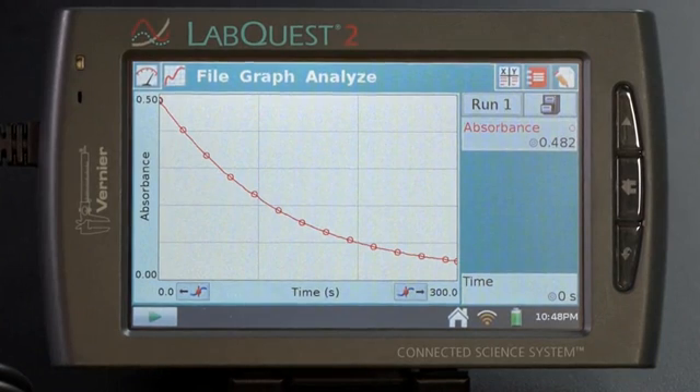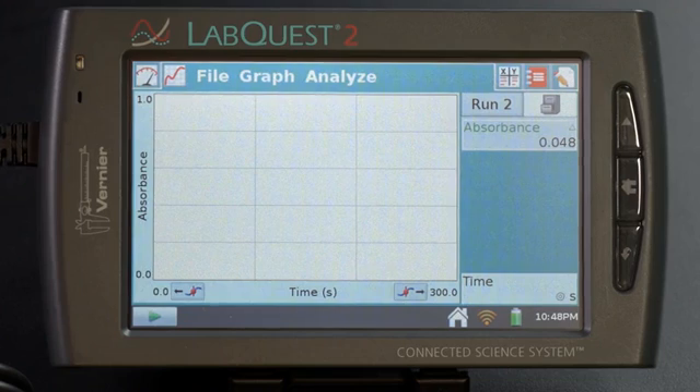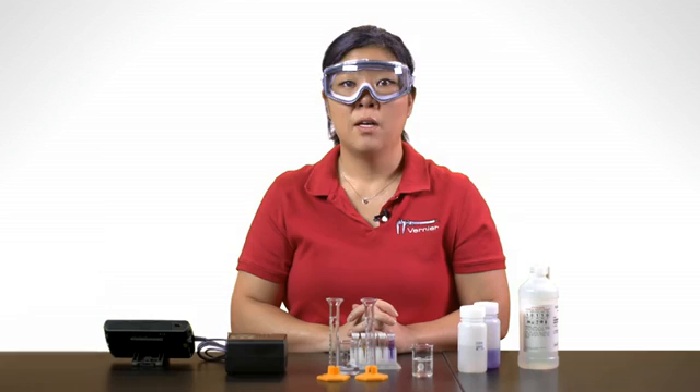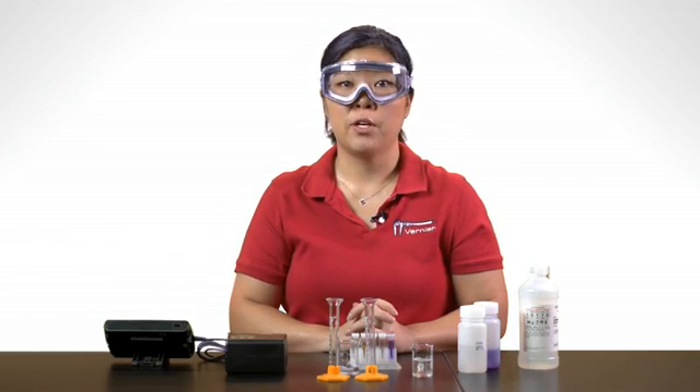Here are some sample results of the data. To save this run and get ready for the second run, tap on the file cabinet icon. This saves the data and you're ready for your next trial. The next part of the video will go over the same information but using a computer for data collection.